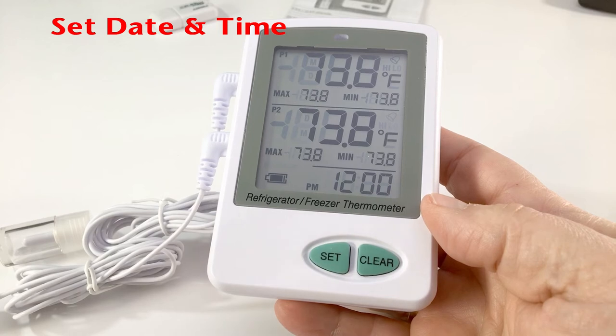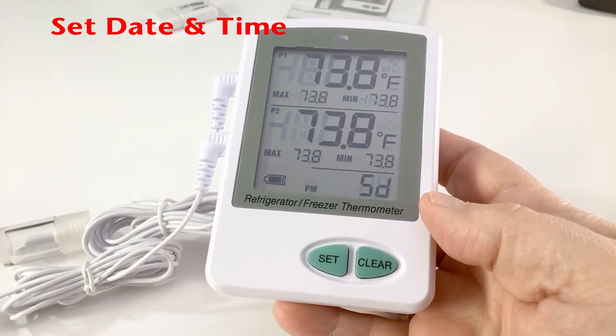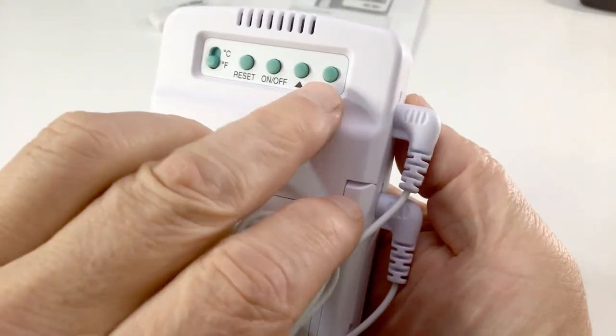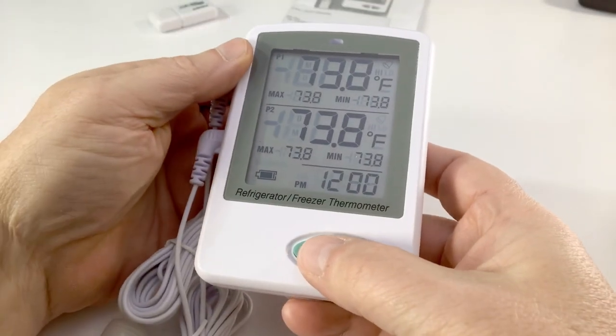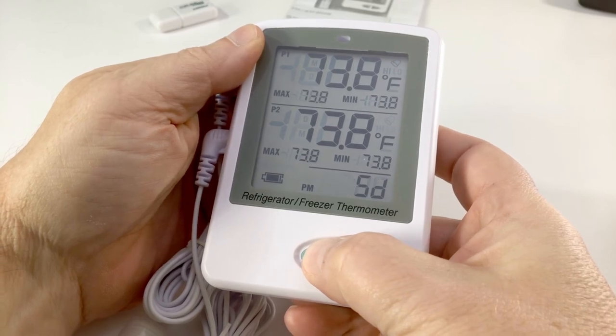We are ready to configure the unit. First, set the date and time. To do that, press the Set button and the down arrow button on the back simultaneously, until 12H shows on the screen.